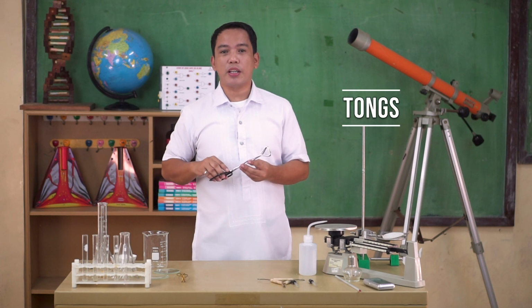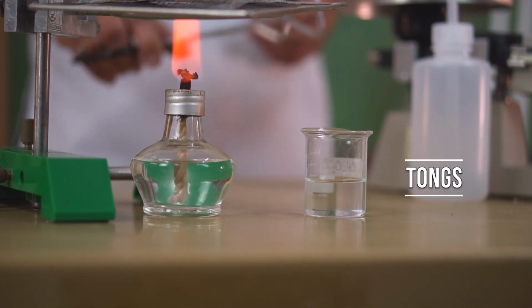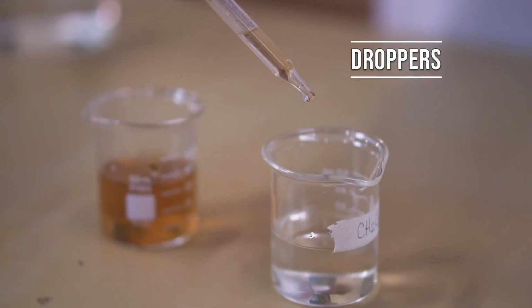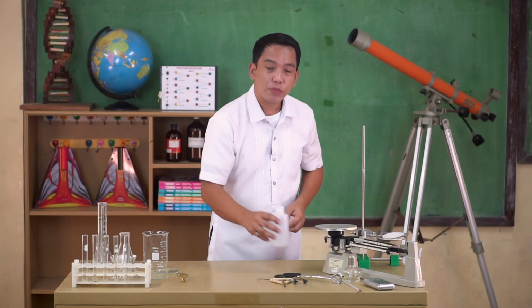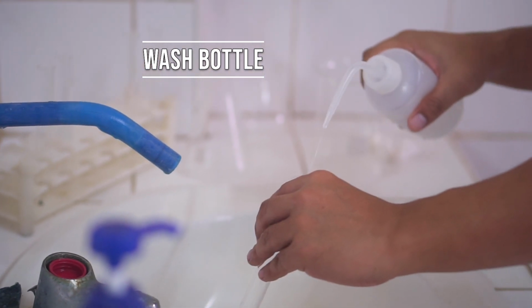Tongs are similar in function to forceps, but are useful for larger items. Droppers are used for adding liquids drop by drop. Wash bottles are used for dispensing small quantities of distilled water.